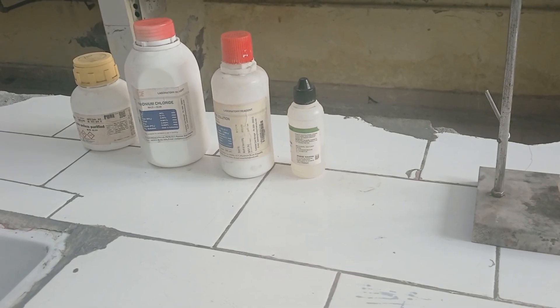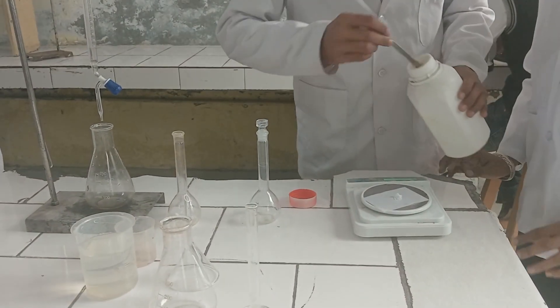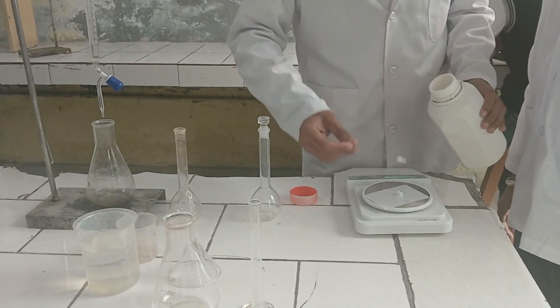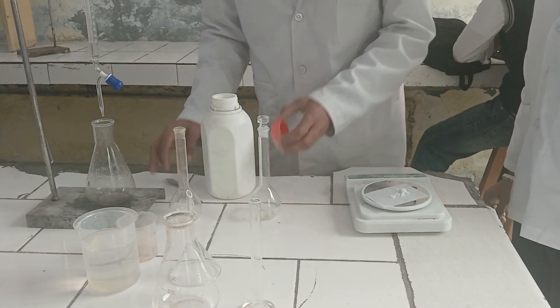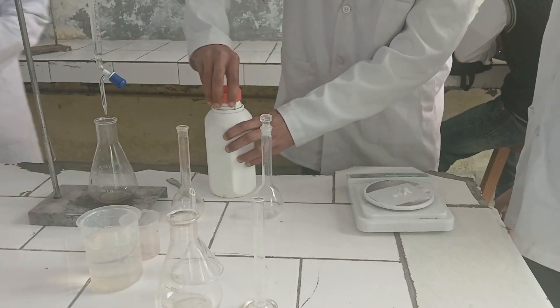Here are the chemicals and glass wares. First, we have to weigh 0.1 gram of ammonium chloride and transfer it to the volumetric flask. Then make up the volume.